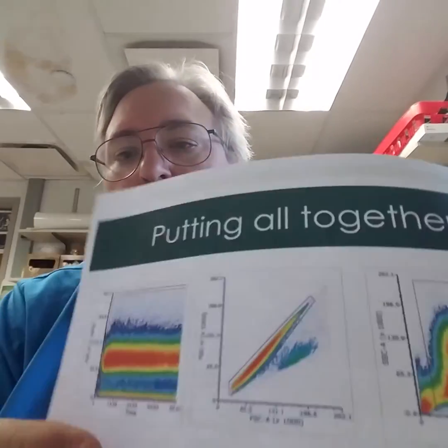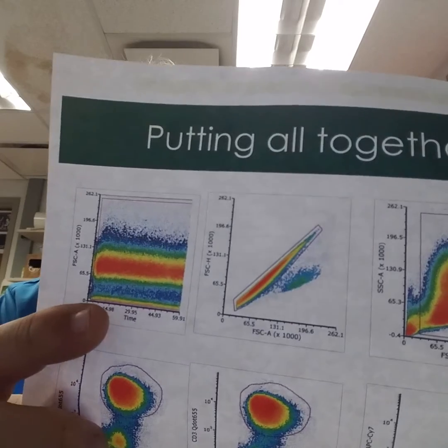This is where the FMO controls might come into play. Here's an example: I start off with this first gate, which is a time gate. I look at time versus scatter to make sure I had an even flow. I use that gate to eliminate things at either end which might have been problems, or if there's discontinuity within the population, I can remove that by a gating strategy. There's also automated software that will do that for you.